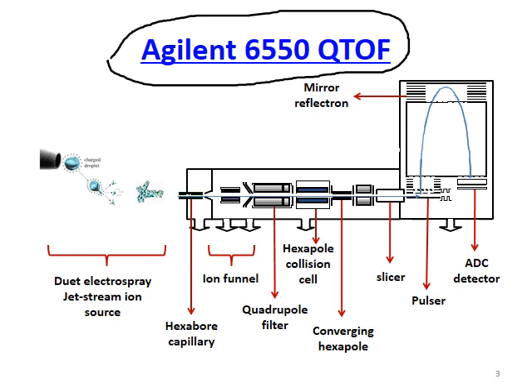Moreover, for a specific TOF instrument, if the design achieves a better measurement of the time that ions require to hit the ADC detector, it would improve the mass accuracy.